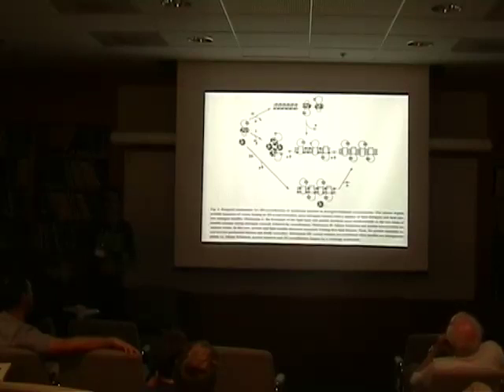aggregates of protein and detergent that are formed separately, and then upon detergent removal, they mix again and form the crystals. That happens sometimes when, after detergent removal, you have a huge aggregate of lipid and protein, and upon time incubation, you see some crystals that are growing from the stuff.